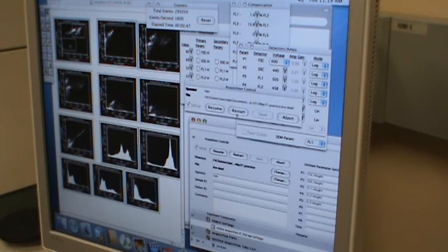Still, it's actually probably a good thing. Even though we left all the cells there, most of them still seem to be alive. But these can live for months in water. Actually, we didn't even leave them that long. We left them immediately, so that's actually even shorter. So, okay, I'm going to save this file. Okay, and it saves immediately because there are so many cells there.